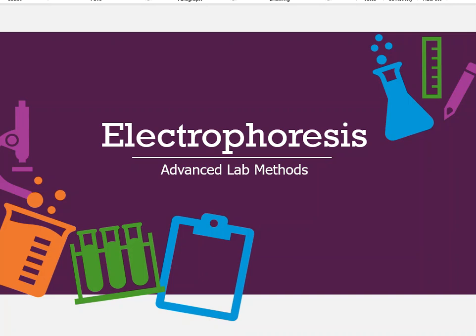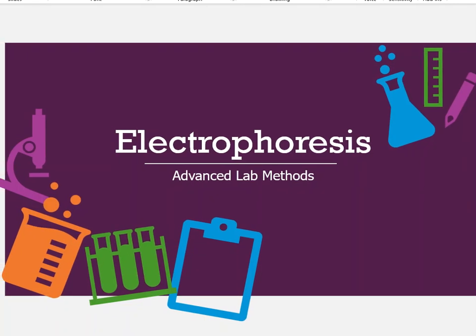Alright guys, in this video we're going to talk about the process of electrophoresis. And electrophoresis is a process, and guess what? This is advanced lab methods, and we talk about processes that we do in a lab, and this is one of them. So we need to talk about the fundamentals of electrophoresis. How does this work? Why does it work, and where is it appropriate?